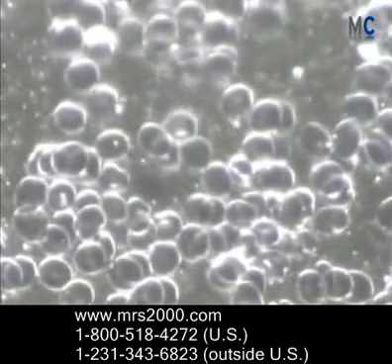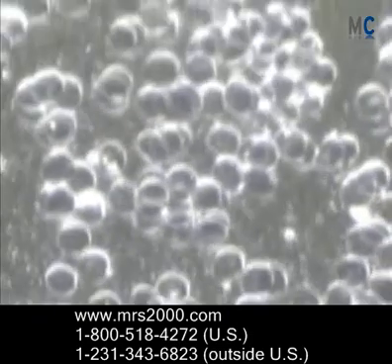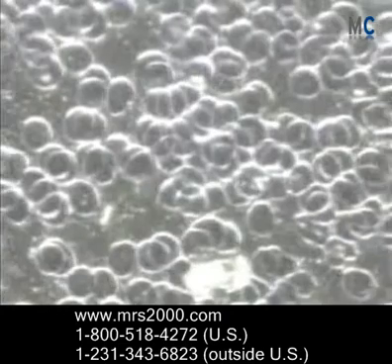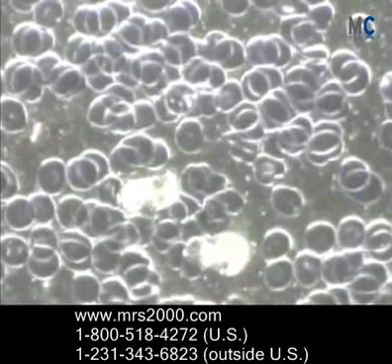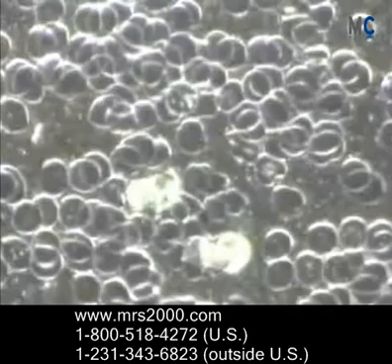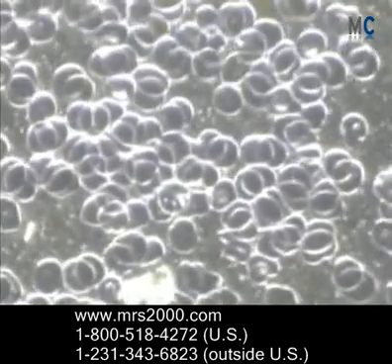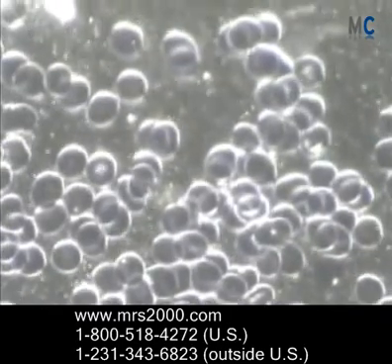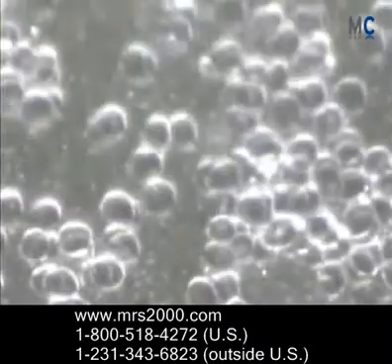Welcome. This is Bryant Myers with MRS2000.com and also MRS-2000.net. I just want to take you through two examples of before and after on live blood microscopy. Live blood microscopy is a way to view the red blood cells under a microscope in real time, so you can see the integrity and quality and overall health of the red blood cells, which is so important for oxygen utilization and nutrient absorption.